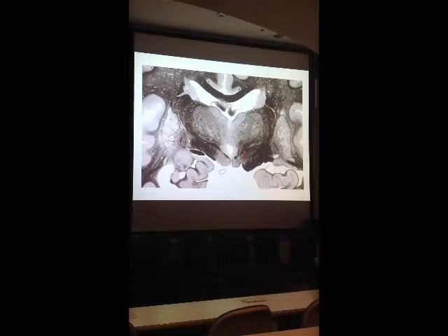The hypothalamus is the inferior part of it. The mammillary bodies should tell you about what level the section is made at. Above the hypothalamus, most all this territory through here is the thalamus, with the right half and left half connected by the massa intermedia. Internal capsule. Good view of the internal capsule. This is part of the posterior limb of the internal capsule. And you can actually see some of the fibers here as they get to the bottom of the internal capsule, preparing to leave the hemisphere. They're starting to collect here to form the cerebral peduncle, which is going to become a structural element of the midbrain that we'll see on the next slide.